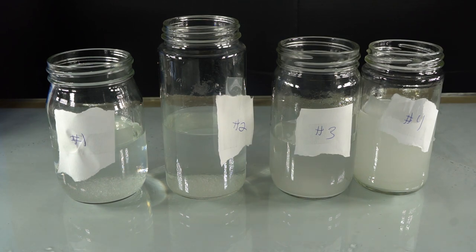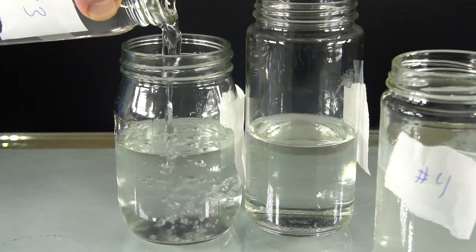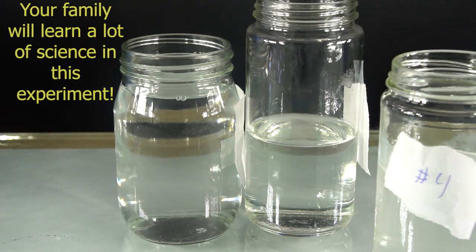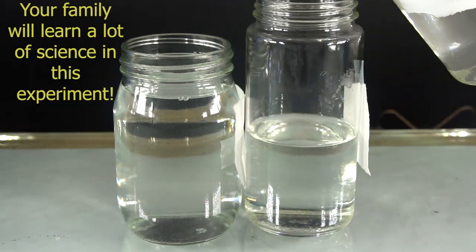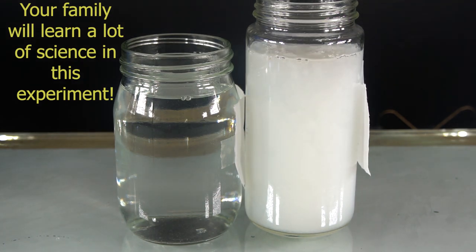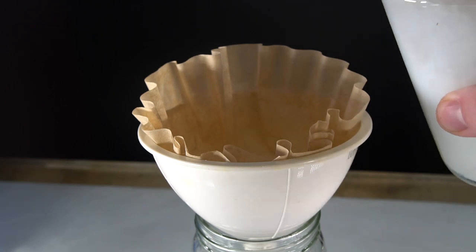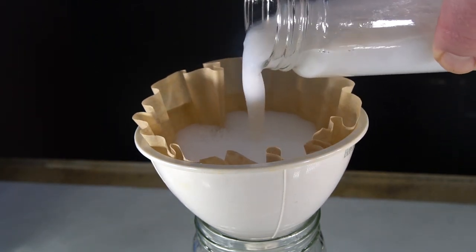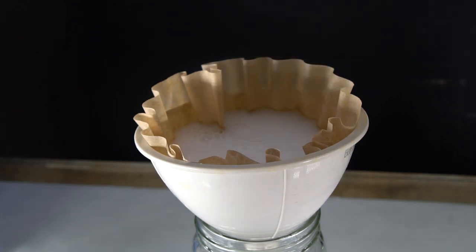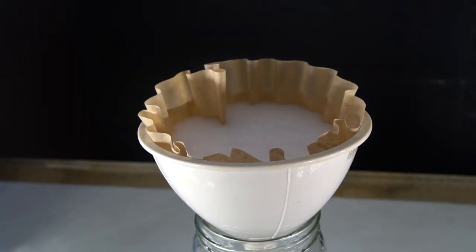In this experiment, kids and parents alike will learn about three types of reactions: decomposition reactions, double displacement reactions, and precipitation reactions. They will learn about solubility and form a beautiful white precipitate before their very own eyes. After performing this experiment, my five-year-old daughter was comfortable talking about which substances around the house were soluble and which were insoluble.